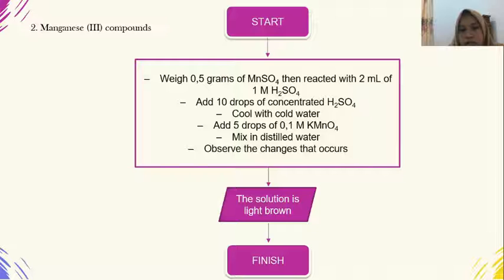Manganese(III) compounds: Weigh 0.5 grams of MnSO4, then react with 2 ml of 1 molar H2SO4. Add 10 drops of concentrated H2SO4, cool with cold water. Add 5 drops of 0.1 M KMnO4, mix in distilled water. Observe the changes that occur. The solution is light brown.